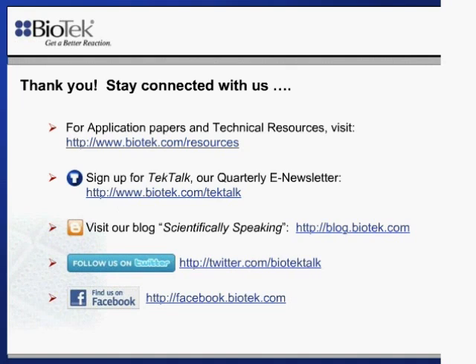I guess that's one disadvantage of using the microspots, is that you certainly can't do a kinetic read on that small of a quantity. Two microliters will evaporate quite quickly, so that's not something you can do. You could, however, use a standard microplate and run growth kinetics in a microplate if you have a suitable seal on the plate, and they do have optically clear plate seals that you could use. You'd probably want to do that in a 96-well or lower density plate, so that you have sufficient volume, depending on how long you need to run that kinetic readout.